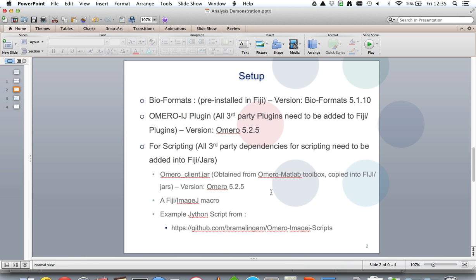That completes this brief demonstration of Fiji-OMERO integration in the batch analysis workflow. Thank you.